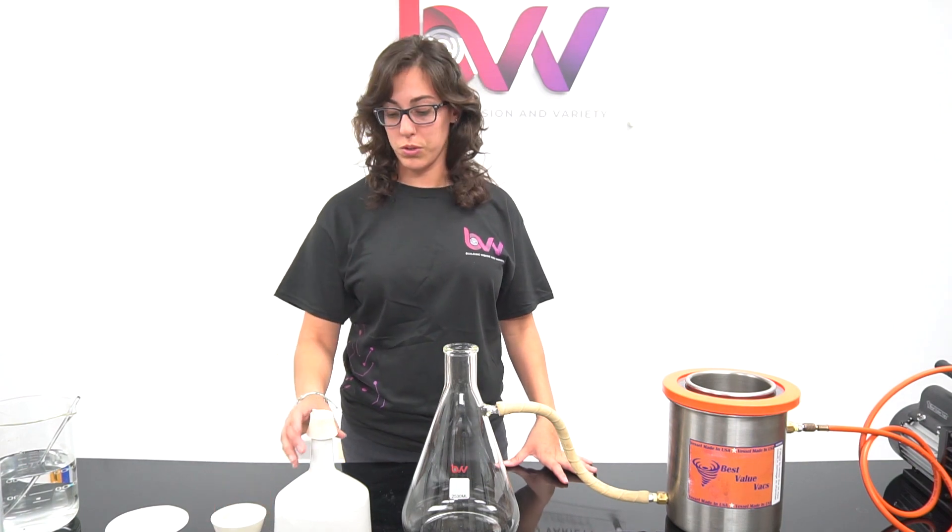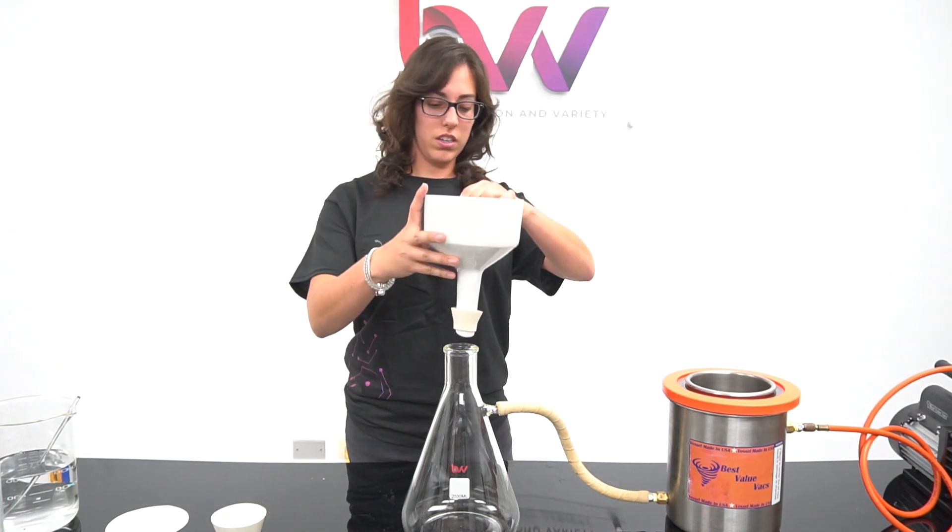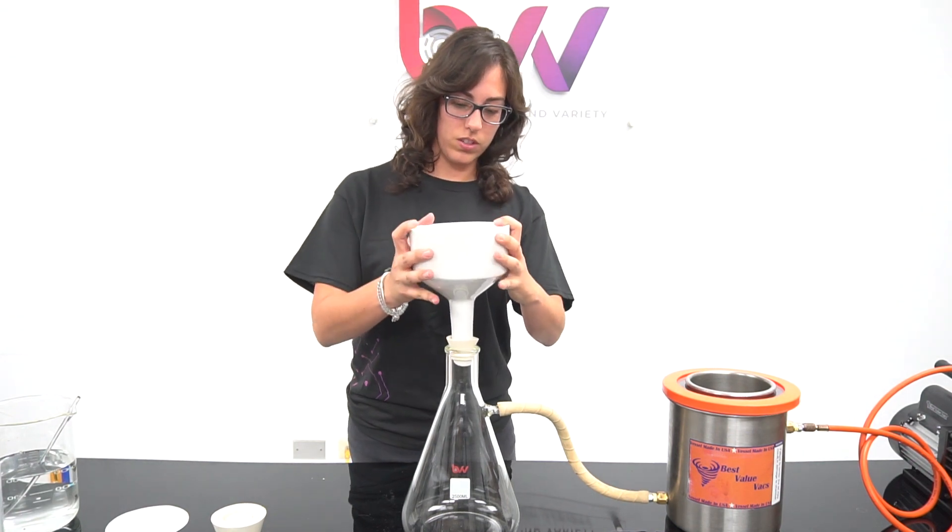To install our funnel on the flask, we find the appropriate size for the rubber cone and place it on the funnel, then place our funnel inside the flask.